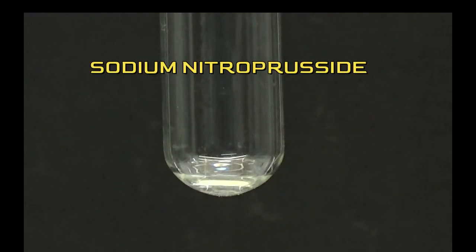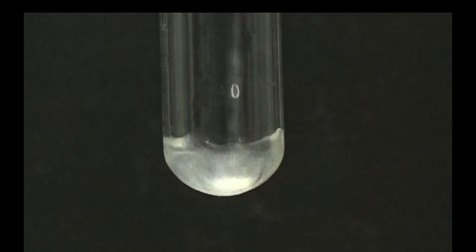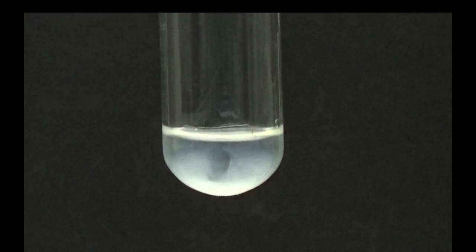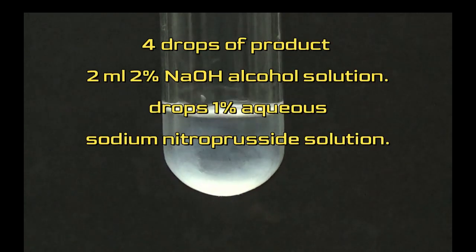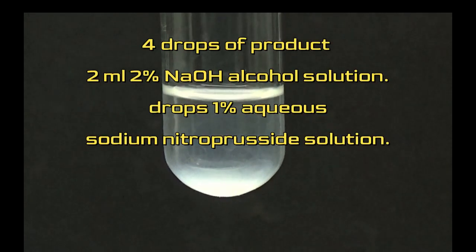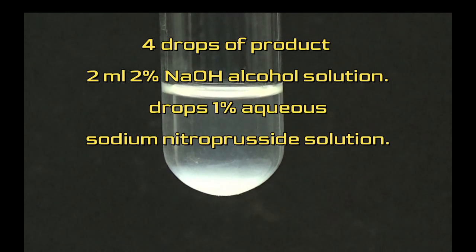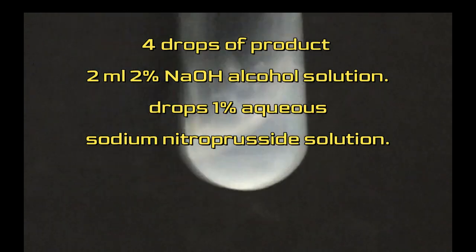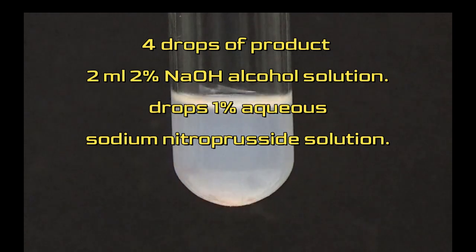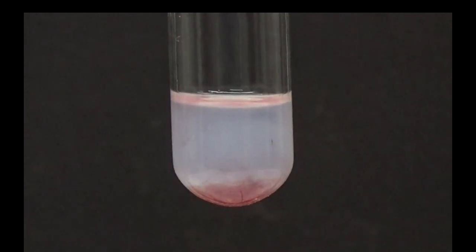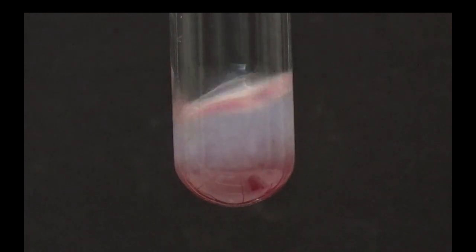The second test is sodium nitroprusside to confirm if the substance is a ketone. In a test tube, dissolve 4 drops of product in 2 milliliters of 2% sodium hydroxide alcohol solution. Add a few drops of 1% aqueous sodium nitroprusside solution. The test is positive if the color is red.